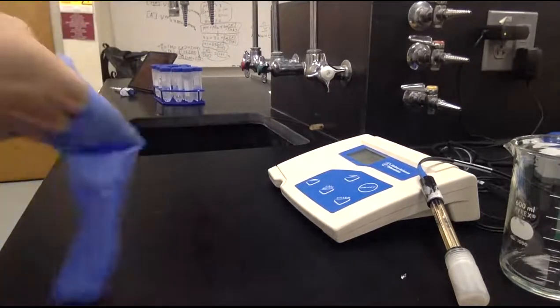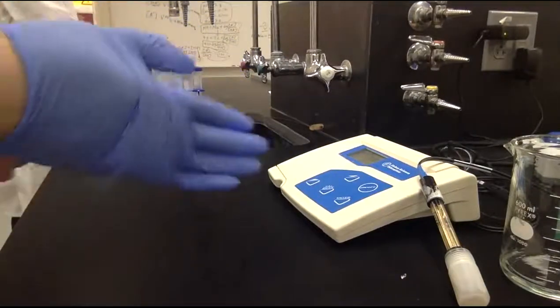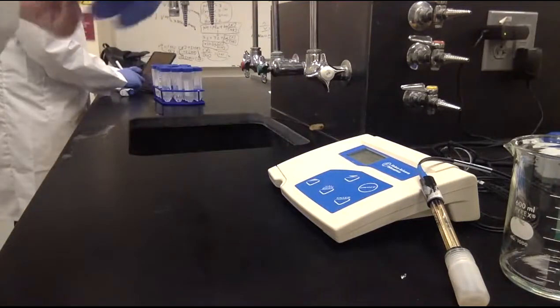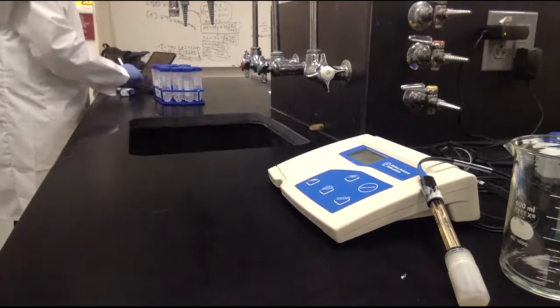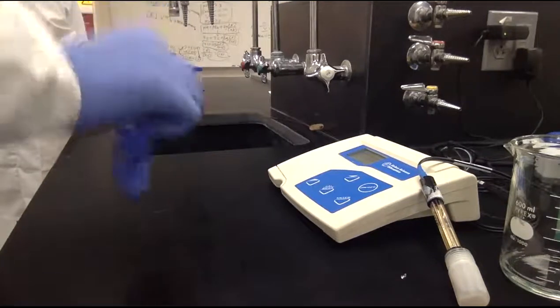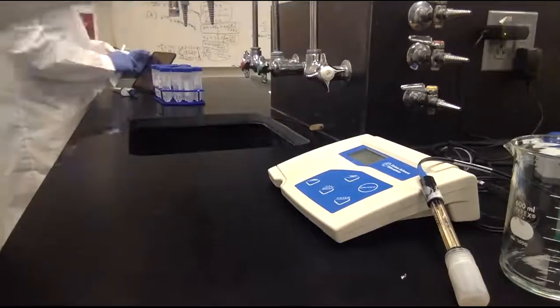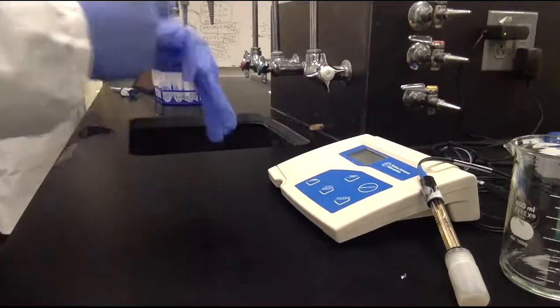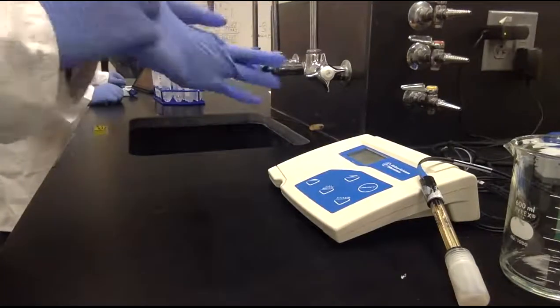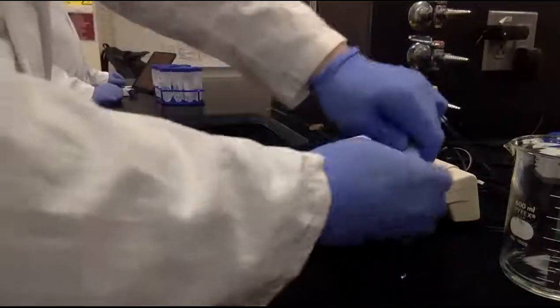So the pH meter, how to use that? The pH probe is always soaked in the saturated potassium chloride solution. The purpose is for protecting the probe. So every time before we use the pH meter, you need to take this probe out of the potassium chloride buffer.